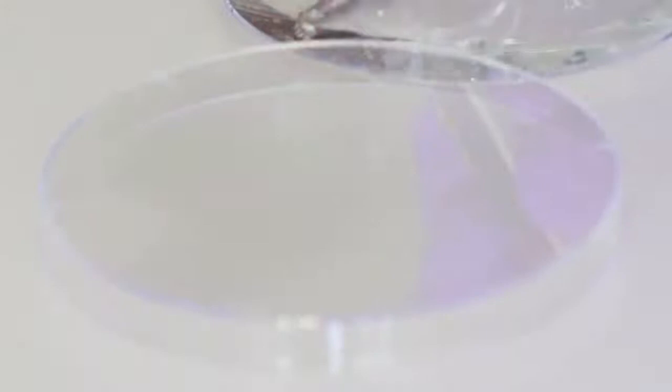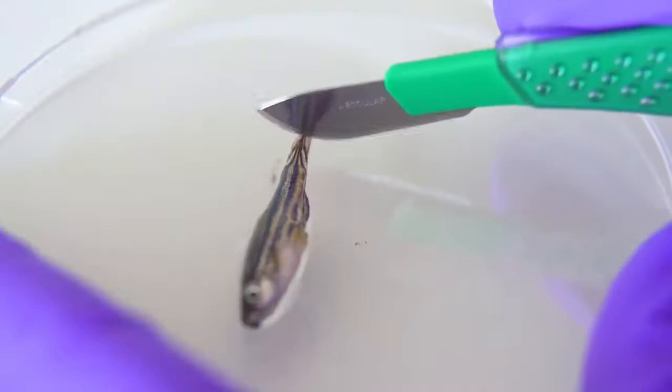For an amputation injury, use blunt forceps to carefully place an anesthetized zebrafish on its lateral side on the inverted lid of a 100mm petri dish, and use a scalpel to resect 50% of the fin.